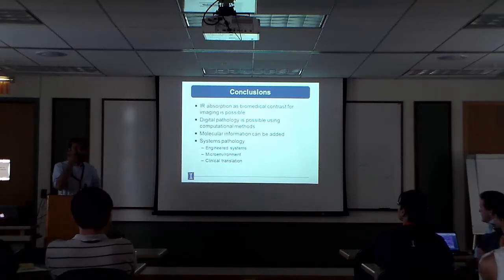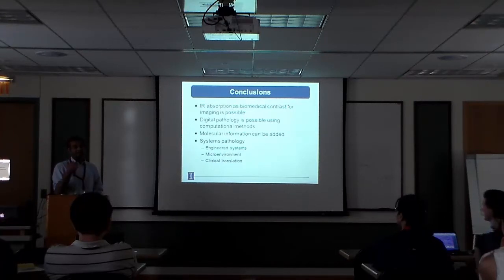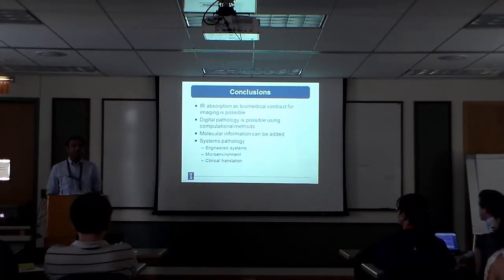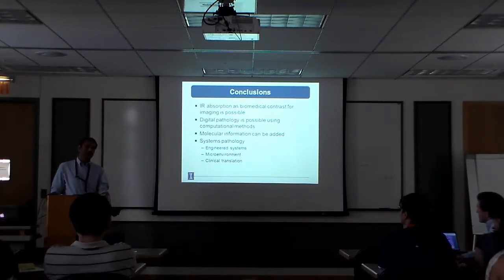And the argument was, when you do a brute force thing like that, you don't know which information you're including, right? Is it the scattering induced information? Is it the chemical information? Is it that? And that's the problem. So if you knew what your input was, if you knew what your variability was, then you could assign the variability into the appropriate bin, like you would do in a PCA, for example. But I personally don't think just statistical processing is enough.